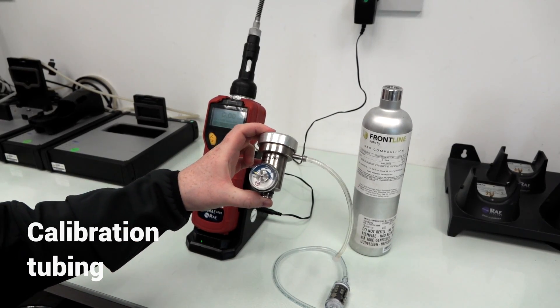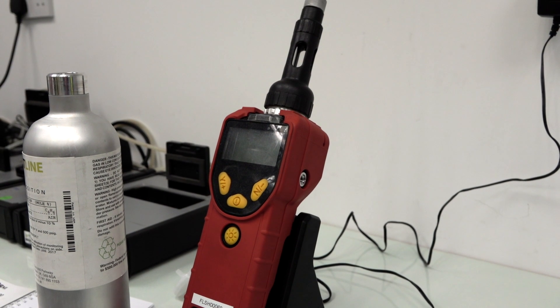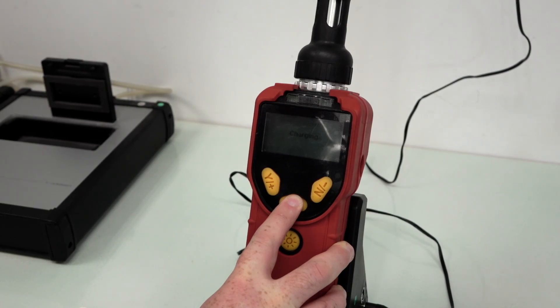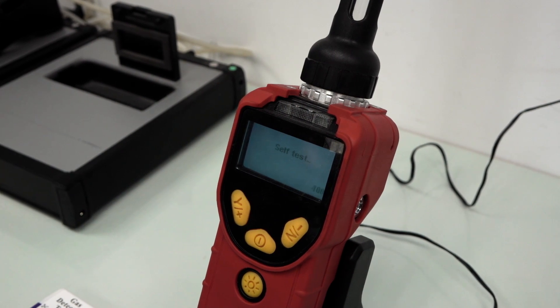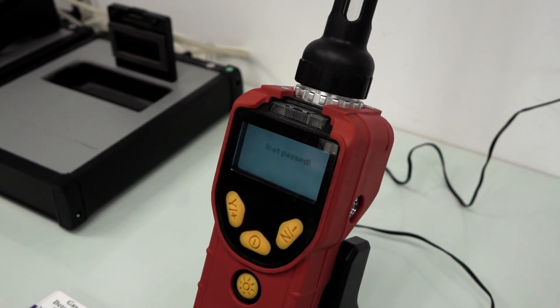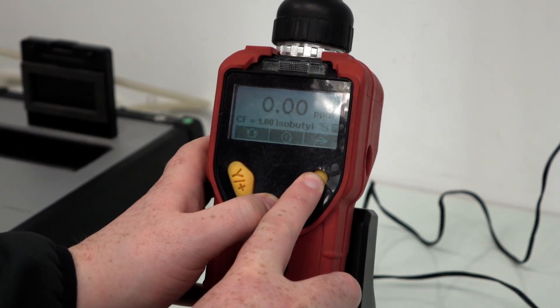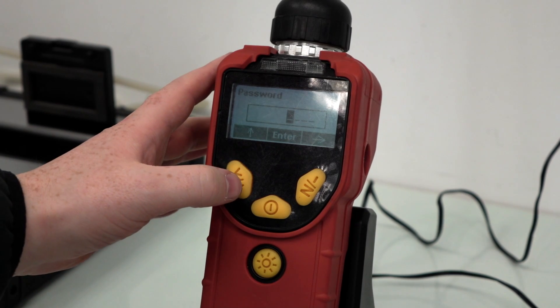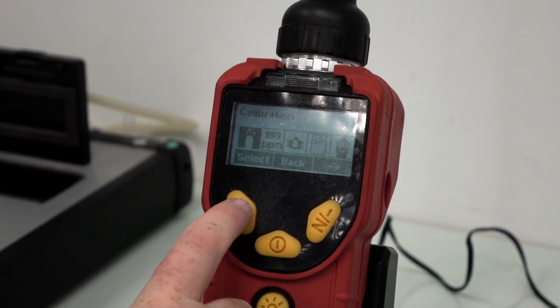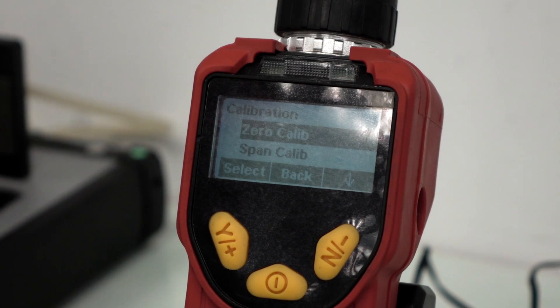And some calibration tubing. When calibrating the Ultra Ray 3000 it's important to note that this is a two-stage process: zero calibration first, followed by span calibration. When performing zero calibration it's vital to do so in a clean air environment. To do this, zero the sensors by following these steps: access the calibration menu and choose zero calibration.